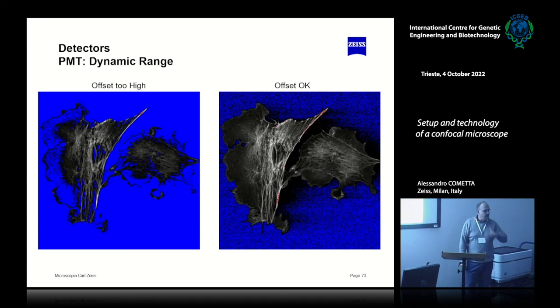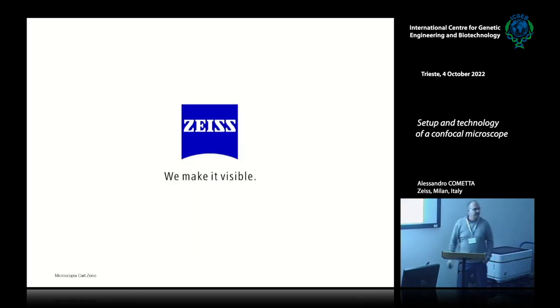Of course, if you have a FISH or some technique that is just zero and one, it is much better to have an image like the one before, so just the dot in the position and nothing else. Okay, I think, yes, this is the last one.